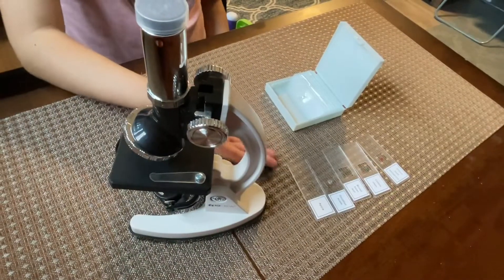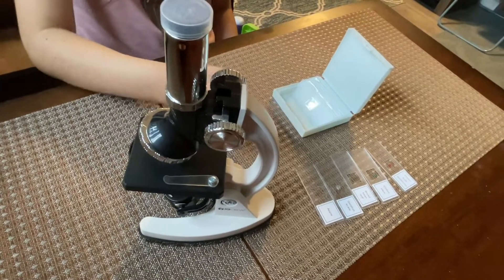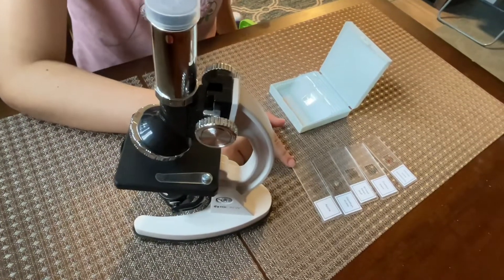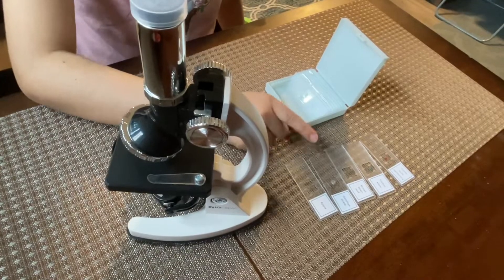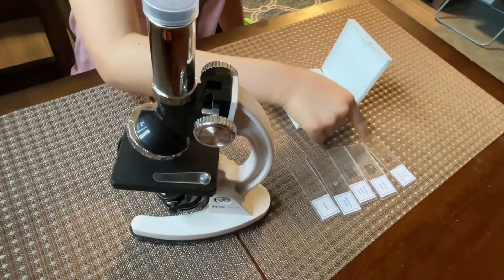I opened the five prepared slides and kept the seven ones in here. So this is the apple, goldfish scale, broad bean leaf, cotton stem, and onion skin.